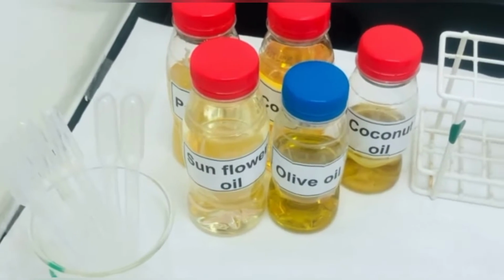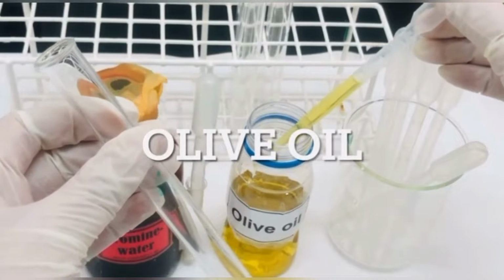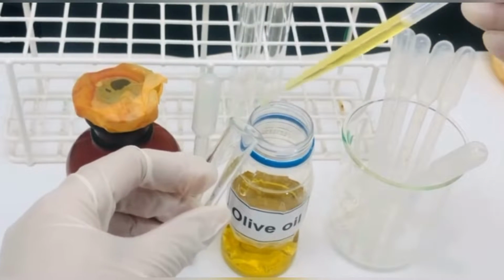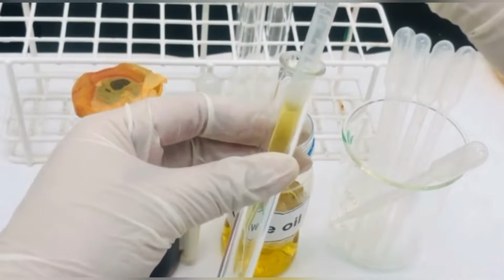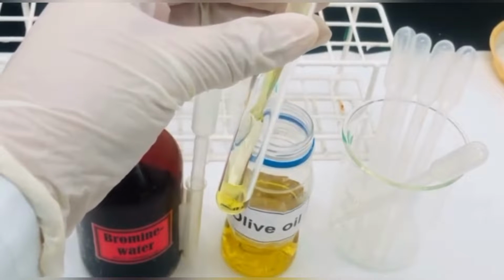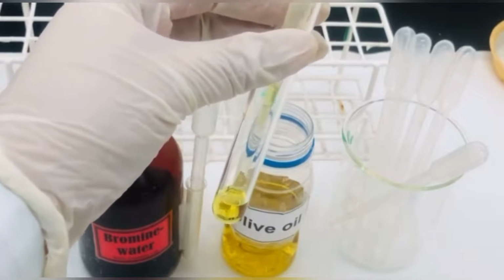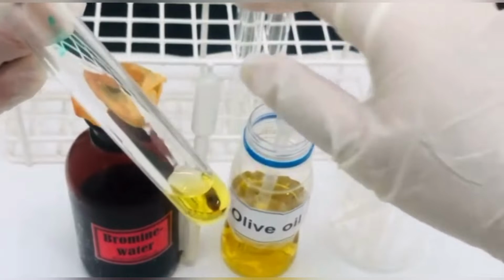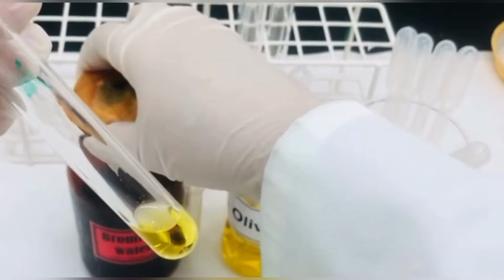droppers, etc. For the experiment, we will take around 1 ml of the oil sample. We have chosen olive oil over here. And we have taken around 1 ml of the oil sample. Now we are going to put a few drops of bromine water.